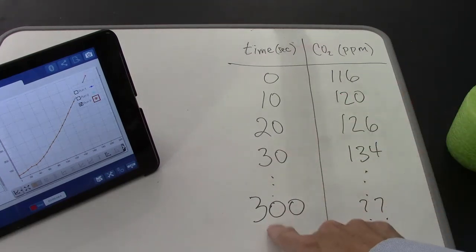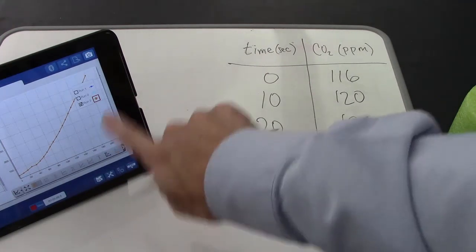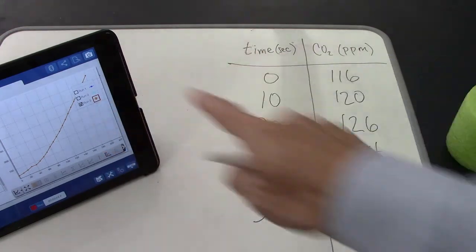It's possible you need more than that, so don't take my word and say I have to stop at 300 seconds. If you're looking at your graph on the iPad and you say, oh, interesting things are happening, maybe you should continue.